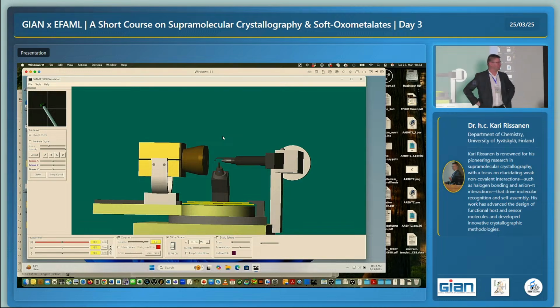And I was very happy that we are able to take my computer in action, because that's the idea. I have some programs that I will use for you this course, and if you are interested in having these programs and using them yourself based on the handouts, they are freely available programs. And this is a really nice program, because with this I can demonstrate a lot of these things that we have discussed in principle with X-rays and diffraction, because we don't need to know anything about what is inside the crystal when the diffraction happens. So this is really pure modeling of this without any knowledge of this.